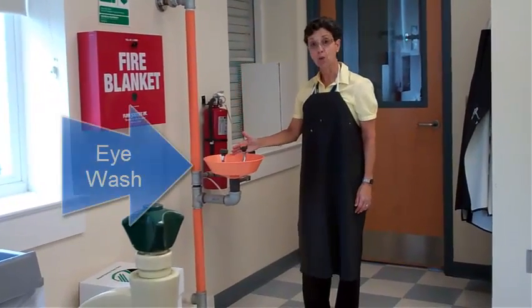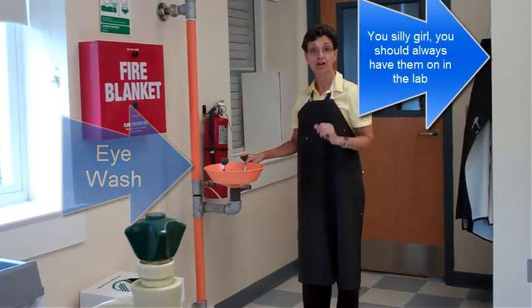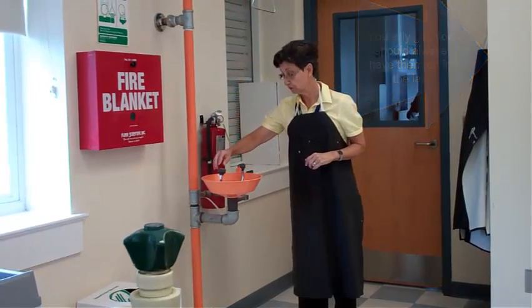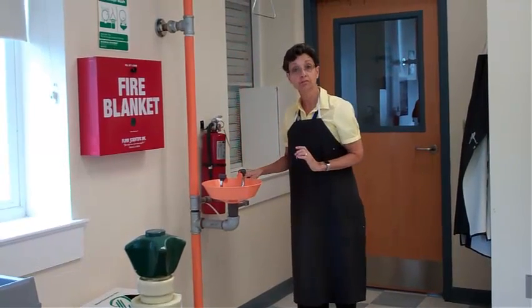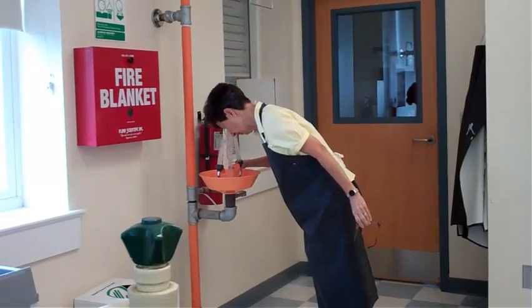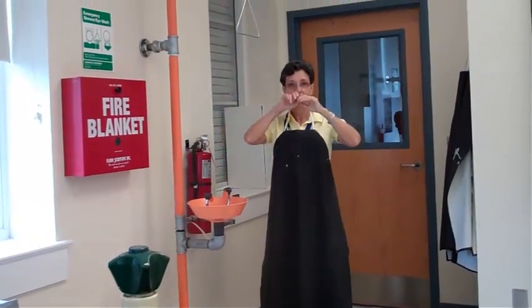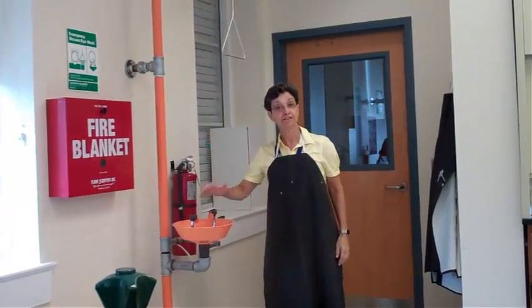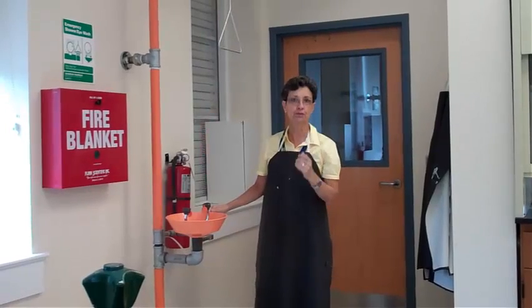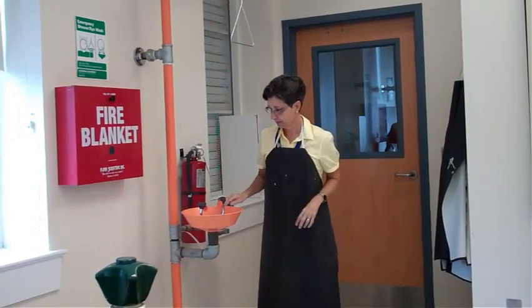Over here is the eye wash. The eye wash is very important. If you should ever not have your goggles on in the lab and you get any chemical substance in your eye, if you're not sure what it is, just come over to the eye wash, push it down, and place your face in there for about 15 minutes. 15 minutes of rinsing will actually do the job. If you happen to have contacts in, you must remove them right away to be safe so that the chemicals are not drawn below or underneath the lens.